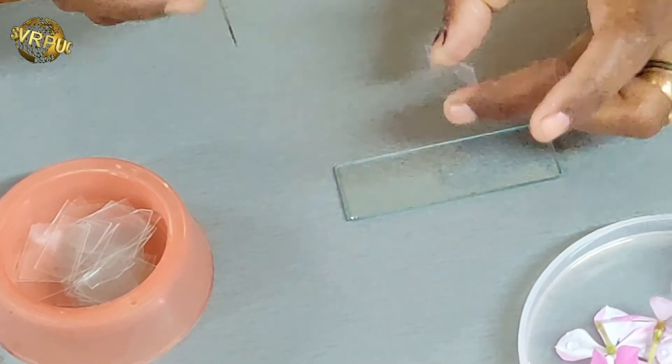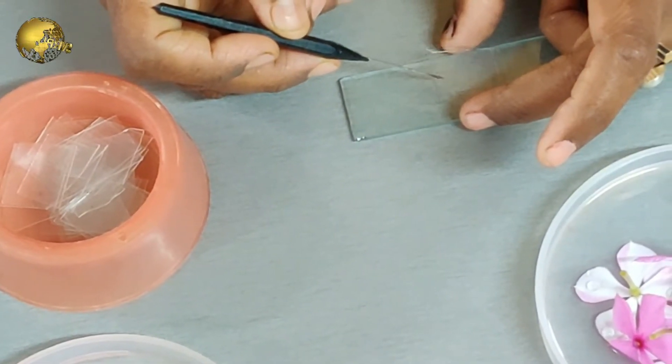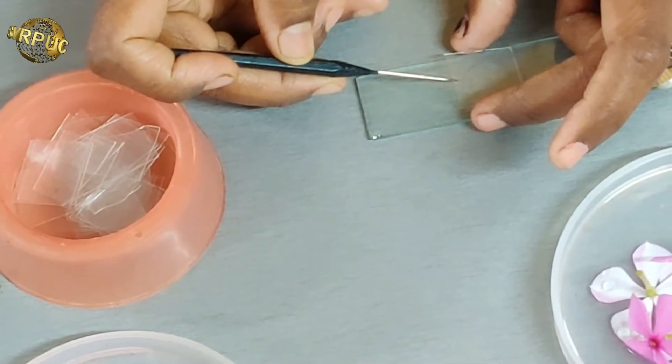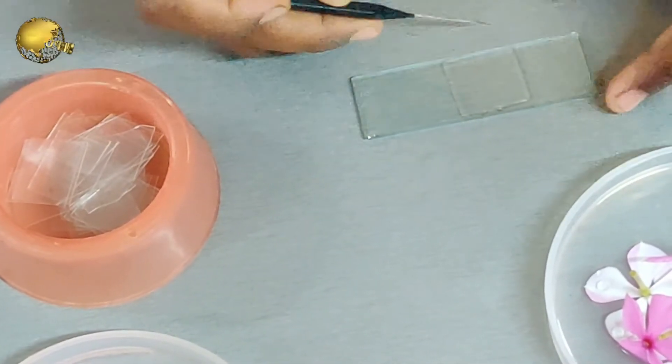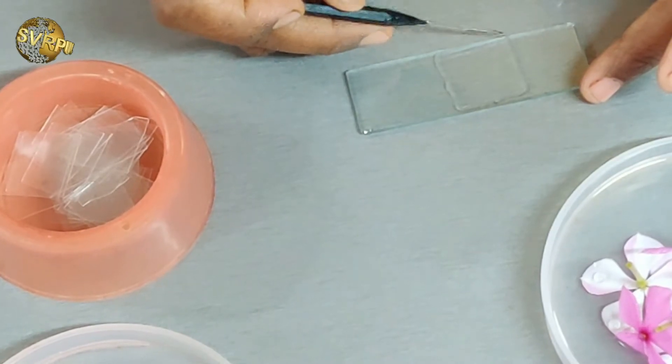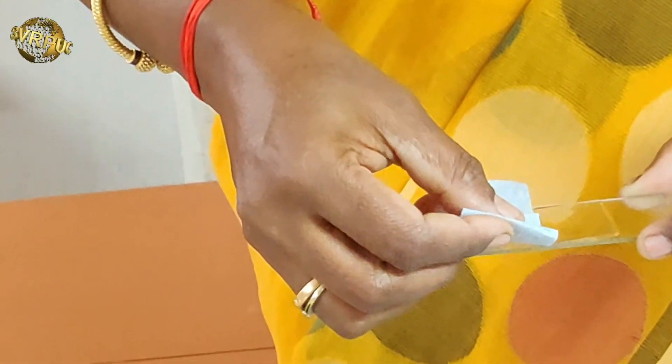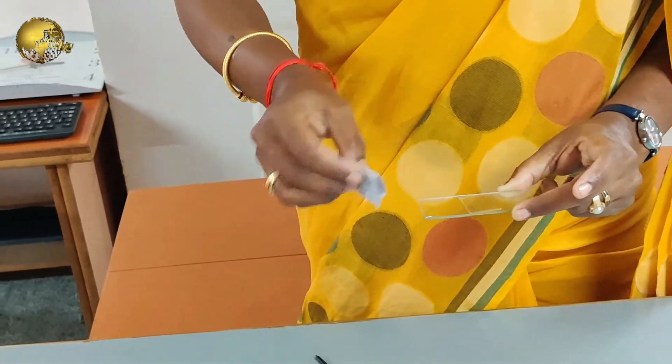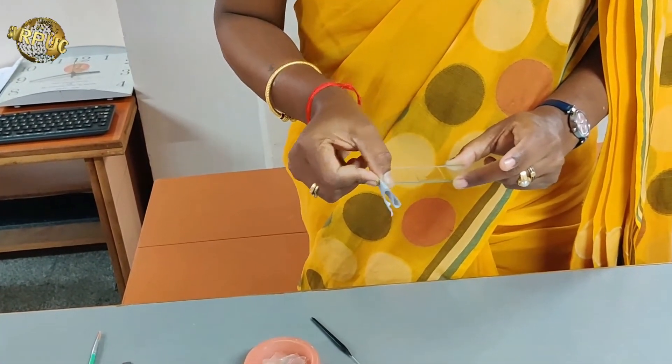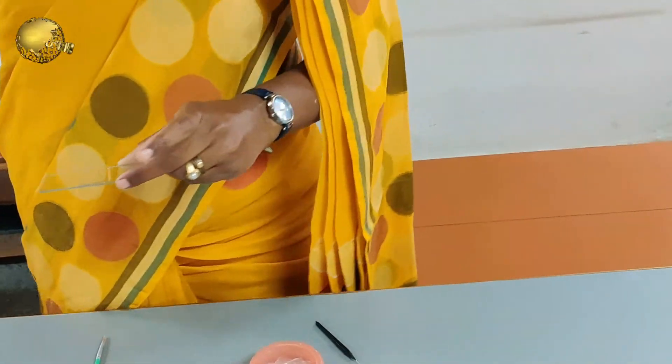Take the cover slip. Lower down the cover slip. Remove the excess. Focus on the microscope.